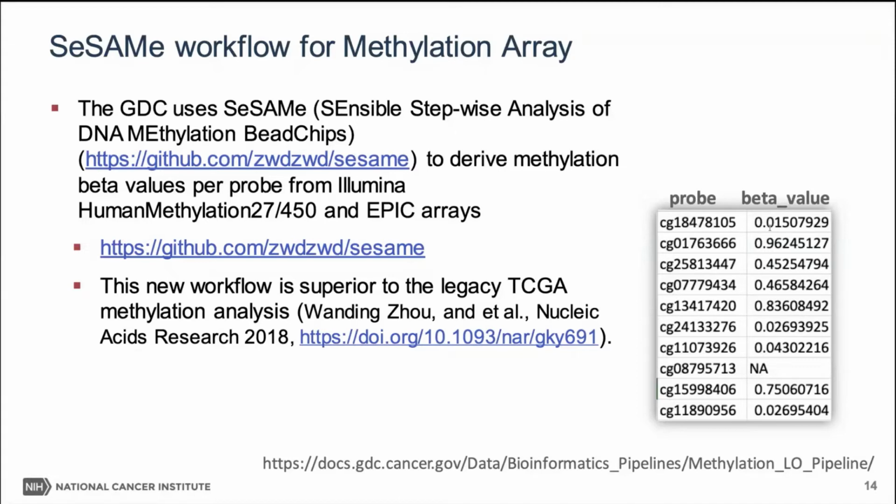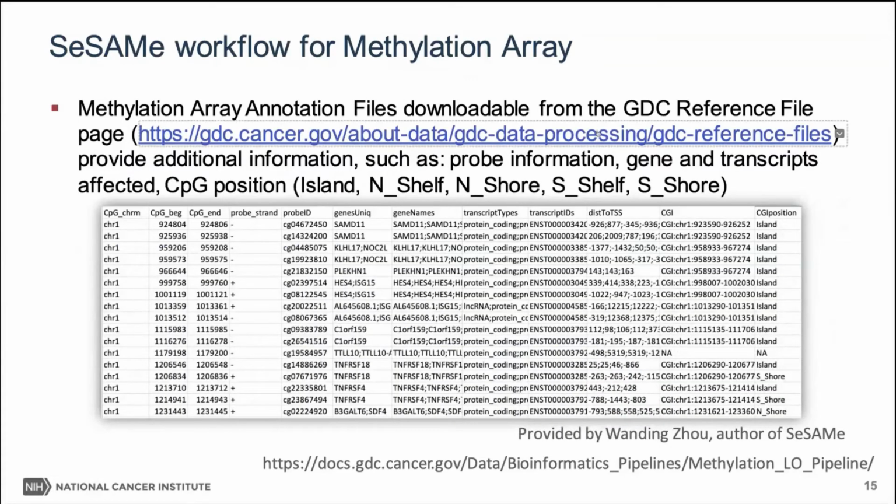If you want to look deeper into this and see how they interact with the other data types, you probably want to know where this probe is, which gene it affects, and what kind of CPG island it's located in, or as a neighbor. So I really encourage you to dig out a reference file from the GDC reference file page. If you haven't used this page, please go looking for it, called the GDC reference file page.